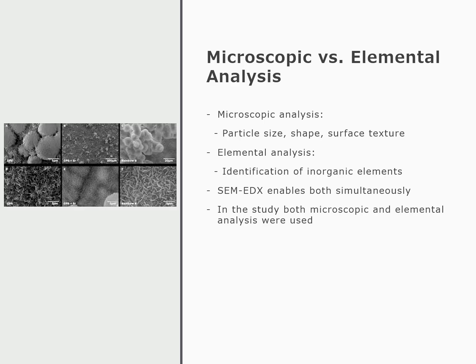In forensic gunshot residue work, particles that contain lead, antimony, and barium with defined spherical shapes are considered characteristic of firearm discharge. The validation study used both analytical modes to confirm particles were truly gunshot residue.